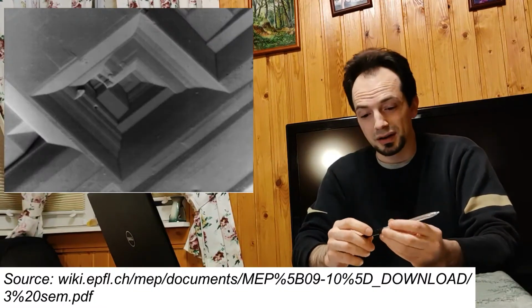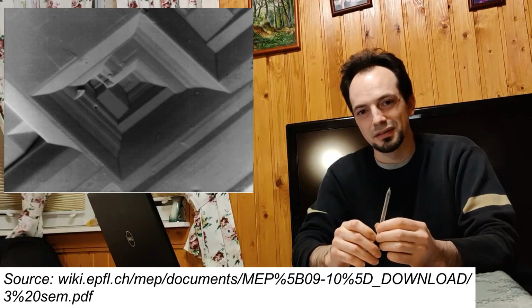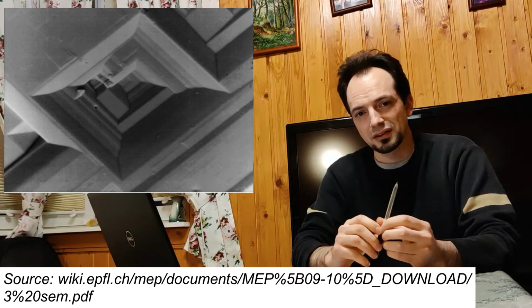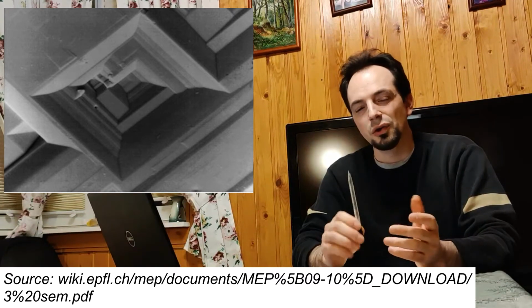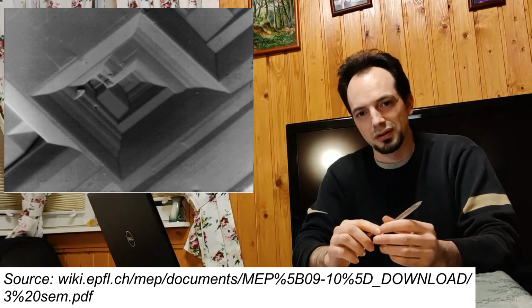Take a look at this one and try to guess if it's a pyramid or the opposite. When not knowing the placement of the detector relative to the sample, you can make an error in this choice. But when you know the geometry of your experiment, then you may be sure about the answer to that question.